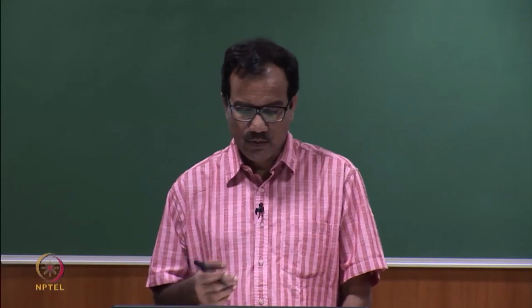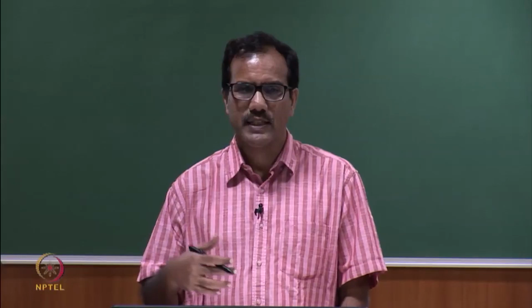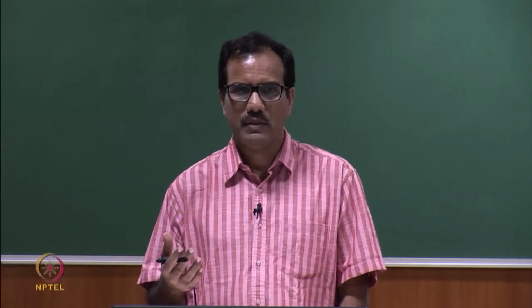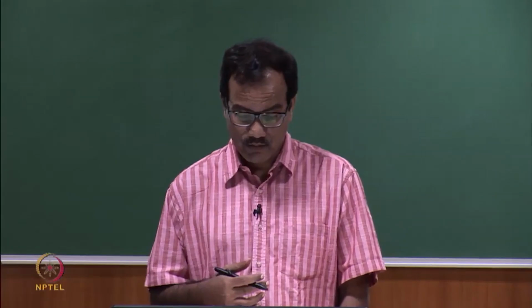We can also talk about size and shape of the molecule. We can talk about molecular interaction, because lifetime measurement can give you idea about static or dynamic quenching, and similarly for FRET measurement we can apply lifetime measurement.